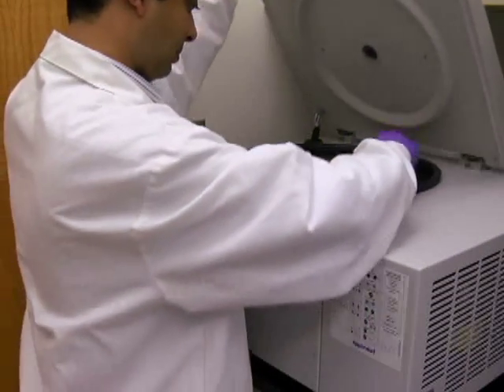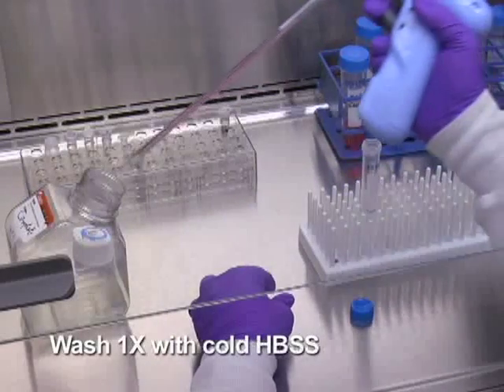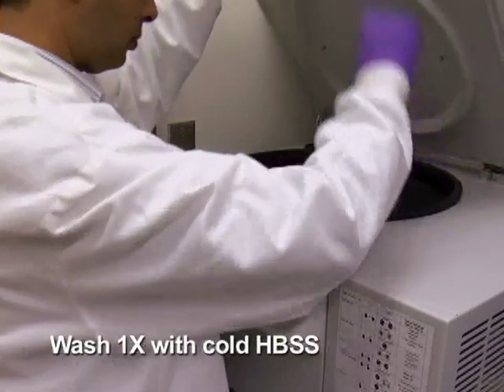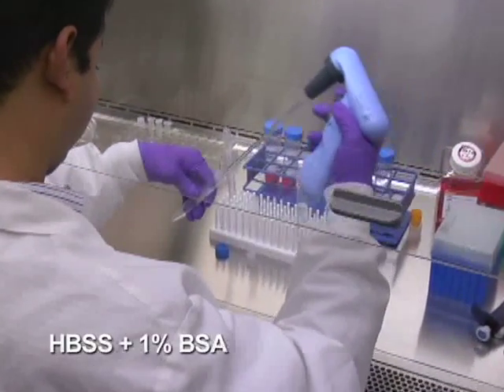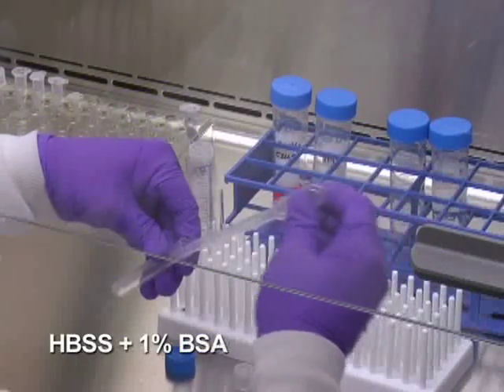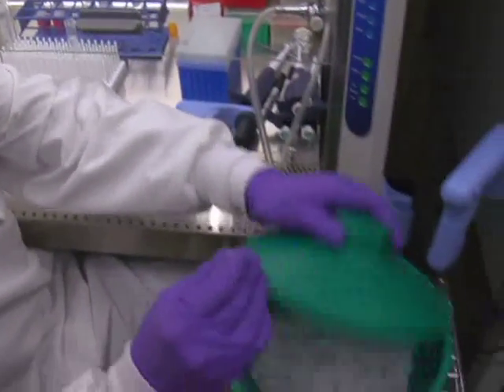Pellet the cells by centrifugation and wash once with cold HBSS. Re-suspend the final cell pellet in HBSS with 1% BSA and keep the cells on ice in the dark for subsequent cell sorting, which is typically performed at a high-speed cell sorter core facility.